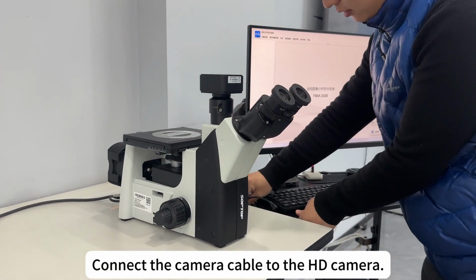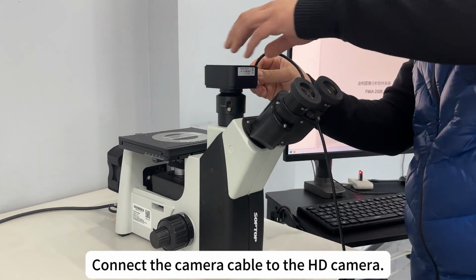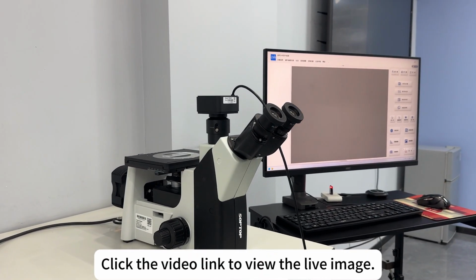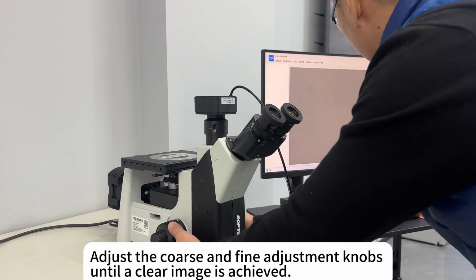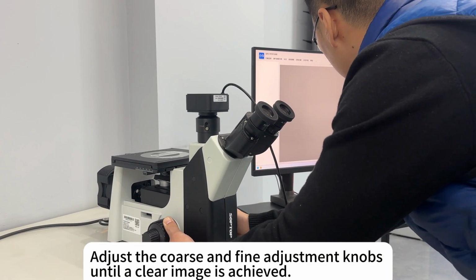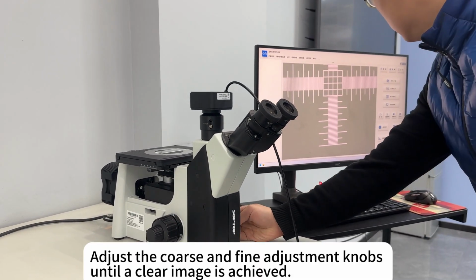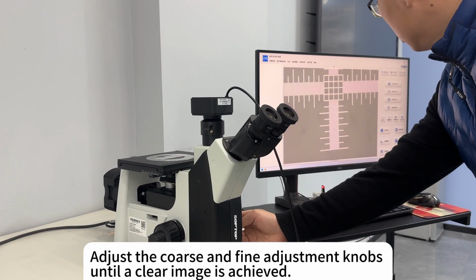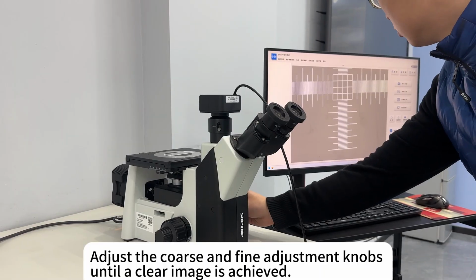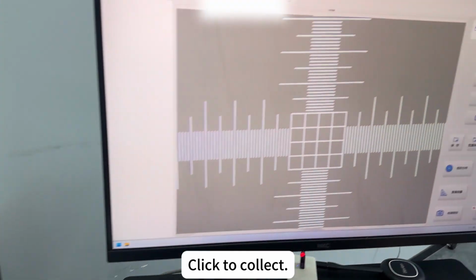Connect the camera cable to the HD camera. Click the video link to view the live image. Adjust the coarse and fine adjustment knobs until a clear image is achieved. Click to collect.